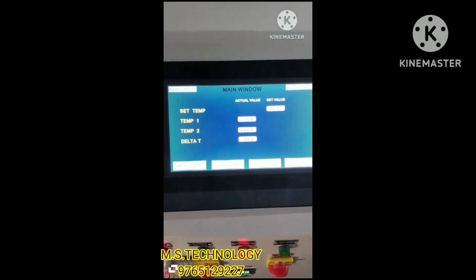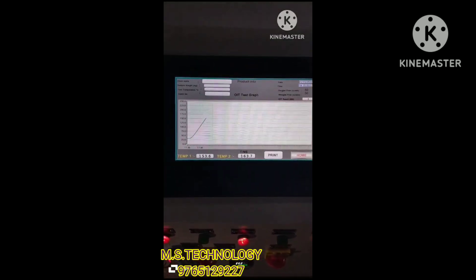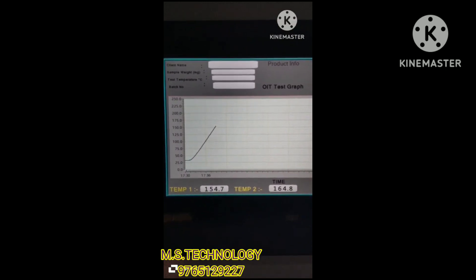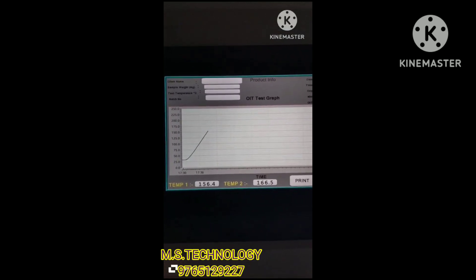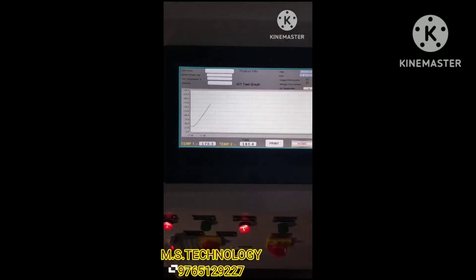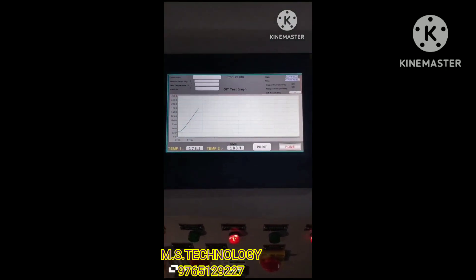To check the graph, click on the temperature graph button. Here you can see the graph — as the temperature rises, the graph goes upward. After 20 minutes at 200 degrees Celsius, nitrogen gas will stop and oxygen gas will start flowing. At that time the graph will be a straight line. If the graph shows a spike after 200 degrees Celsius and is not a straight line, then the test will be considered a failure.